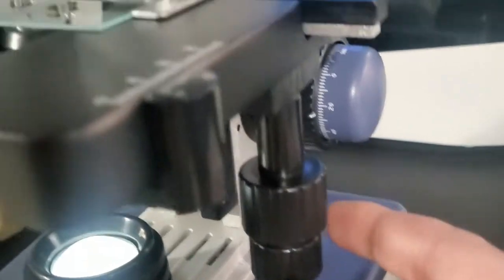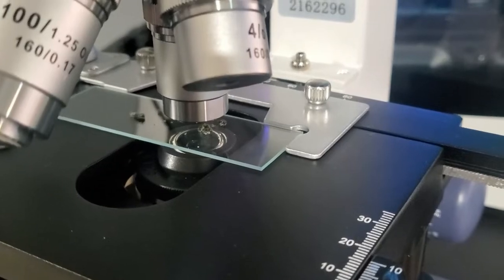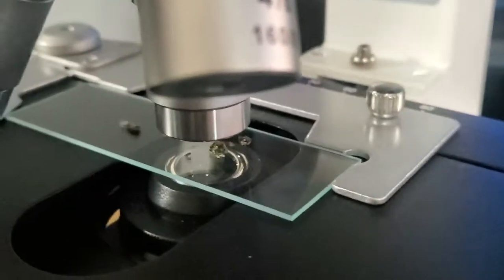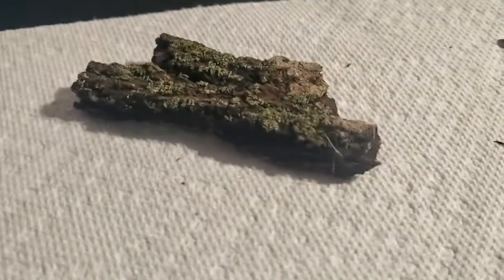There are two controls — one here and one here. The bottom one slides it left and right. I'll show you: look, when I play with that bottom one it slides left and right. Now where'd that tardigrade go? There he is, right there — okay, great. And then this one slides it up and down. So that gives you a few ideas of how that works. I'm zoomed in so much that you could play with this all day and just see so many different things on this one little slide that I created using moss from some bark.